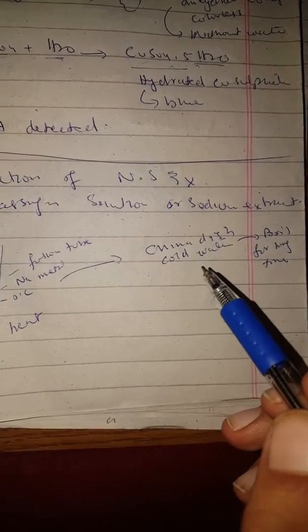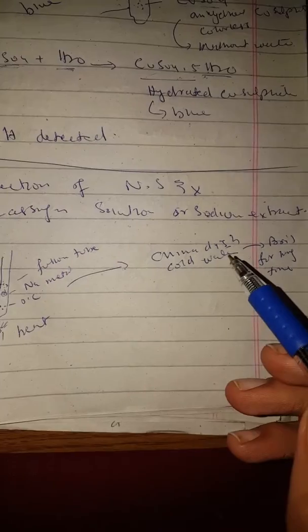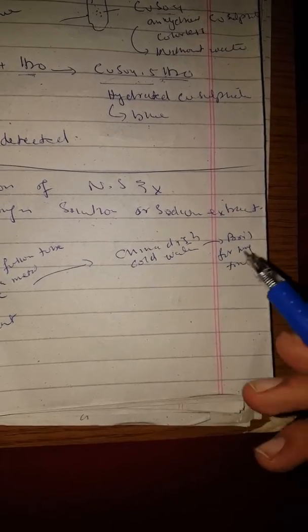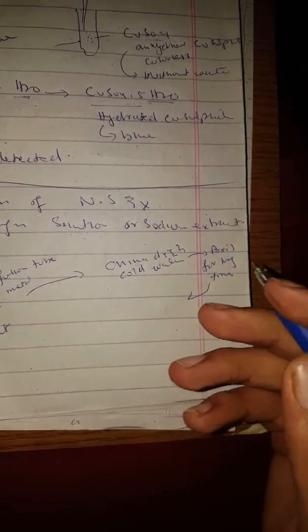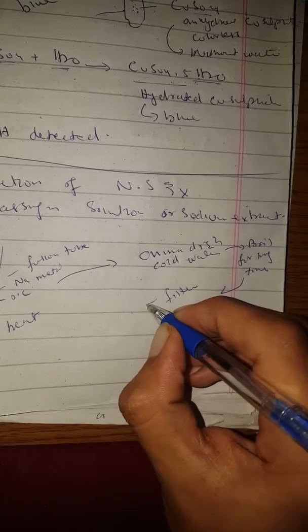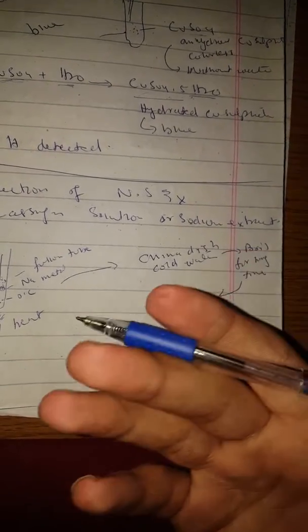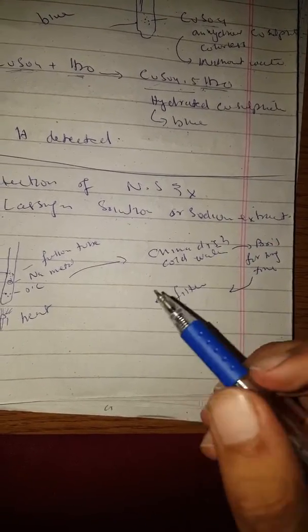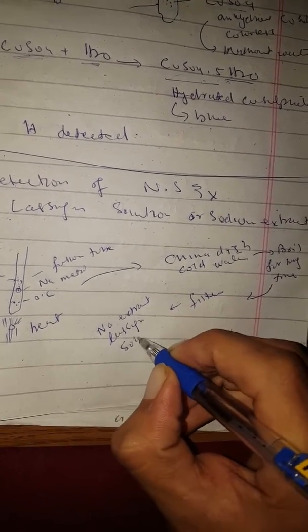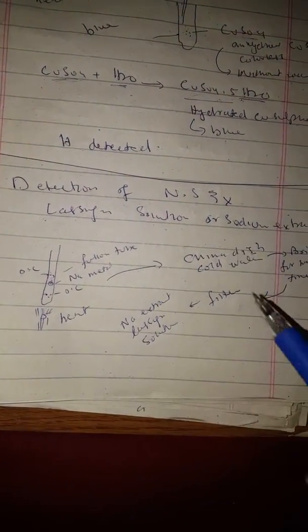When it becomes red hot, we put the liquid into the china dish with water. We then filter the liquid and remove the glass particles. From the filtered solution we obtain the sodium extract, also called the Lassaigne solution.